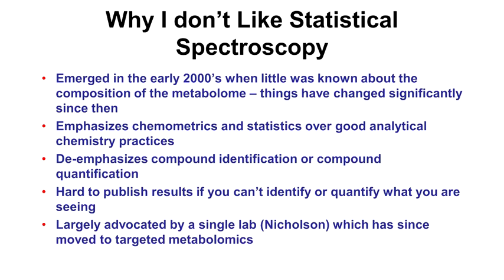Statistical spectroscopy also emphasizes statistics and chemometric methods over good analytical chemistry practices. Now, this can be something that you'd use when you are sort of up against a wall or stuck in a corner, or where you're dealing with something where no one knows absolutely anything about the mixture or the sample. But a good analytical chemist will want to know what they're measuring.